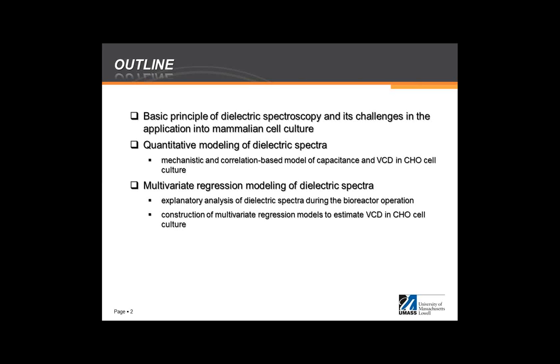And one of the key approaches that we studied is to use multivariate regression modeling of dielectric spectra for biomass estimation. So I'm going to get into a little bit more detail about that. What is the justification, what is the good reasoning of this technology with dielectric spectroscopy.